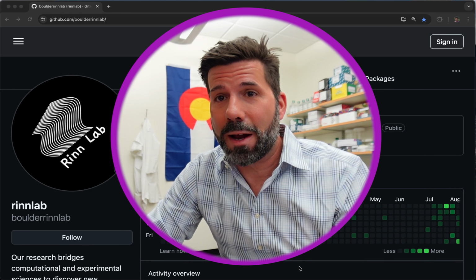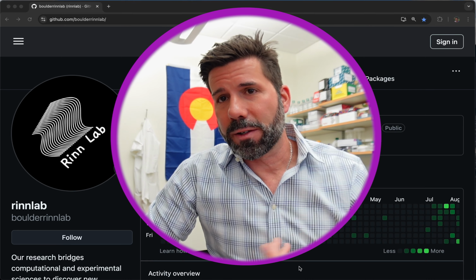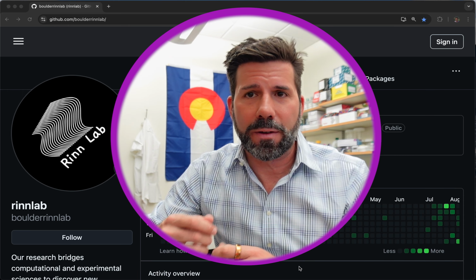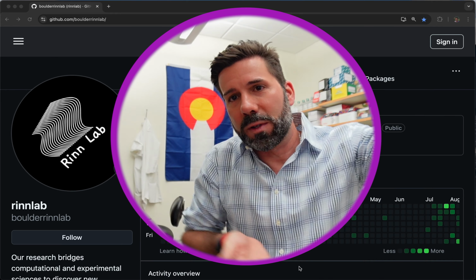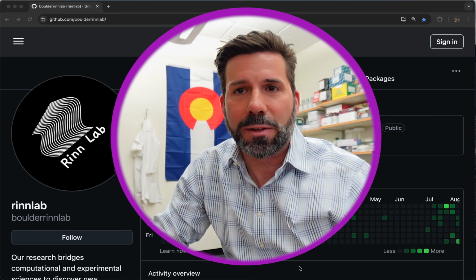Today we're going to be plotting TPM values and learning a few different ways to take averages and standard deviations. Last time we did a grep, calculated the average and a standard deviation, and we're able to plot it that way whenever you have replicates. And today we're going to learn how to turn those columns into rows with a function called melt or pivot longer. There's lots of different ways to do that.